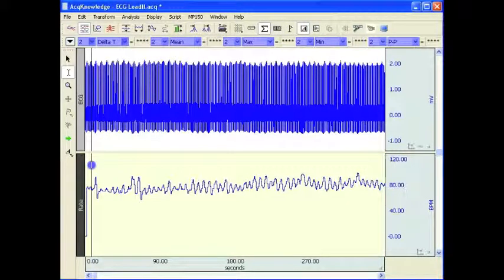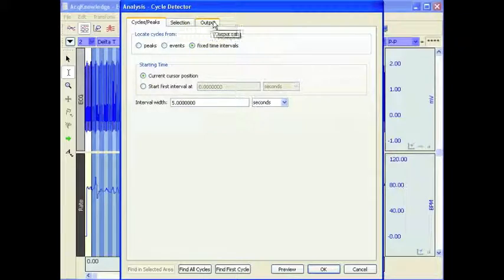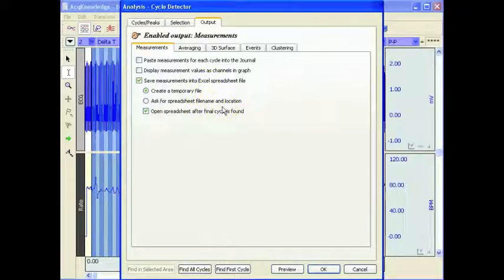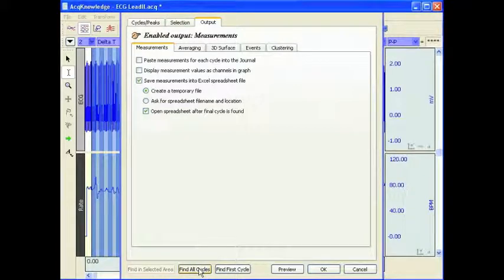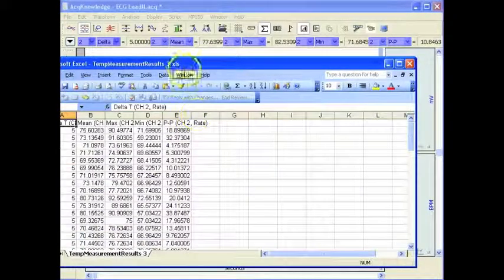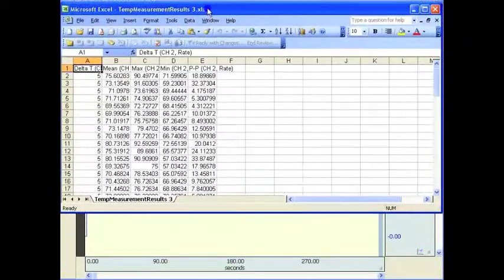I'll turn my journal off and start again. I'll go to my output and paste it into a spreadsheet instead. Find All Cycles. And then in a second Excel will open — there it is.